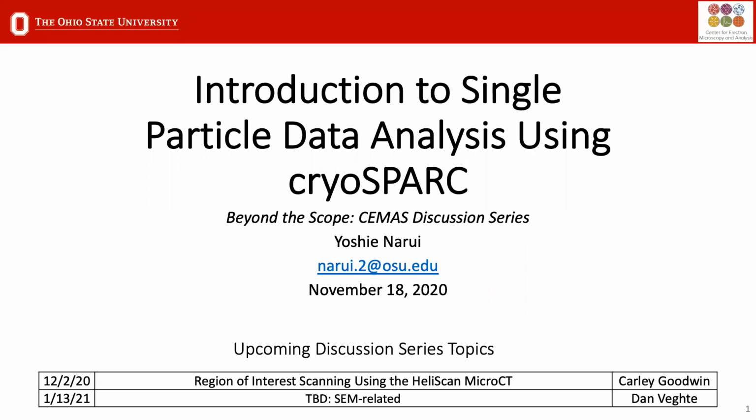And that's what this job right here, job 31, is. And then the input, the parameters that, so it says I'm still building it here, which I am.